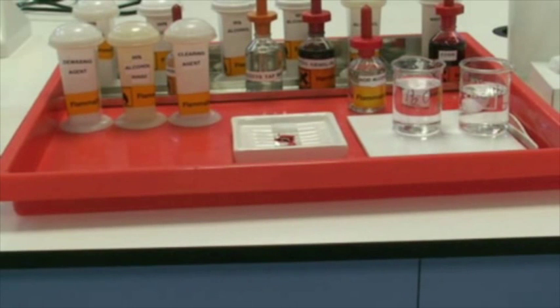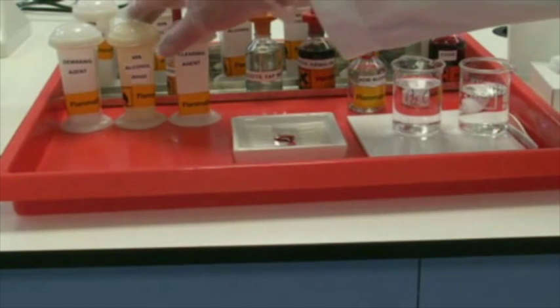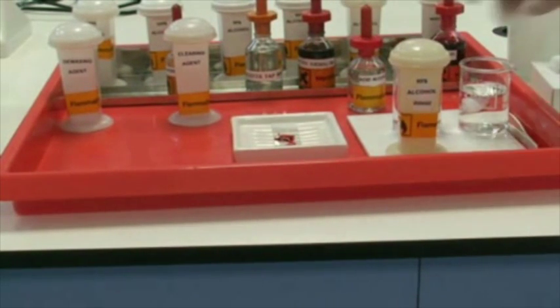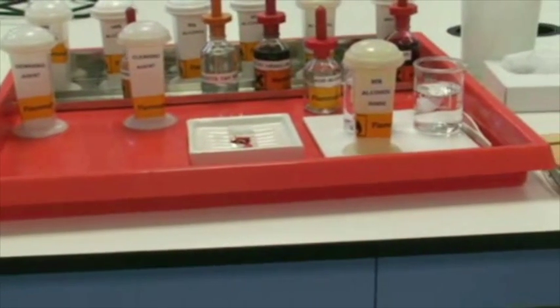For the next step, remember with Eosin, if you use aqueous rinses it will actually elute the stain. So what we're going to use is an alcoholic rinse which has only 5% water within it. I'm going to have that ready at the end of the two minute period.